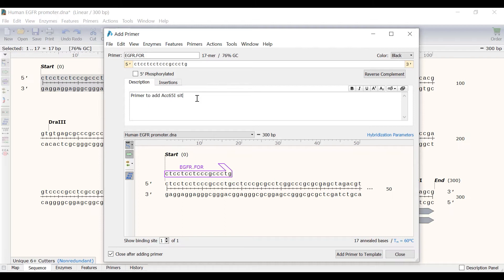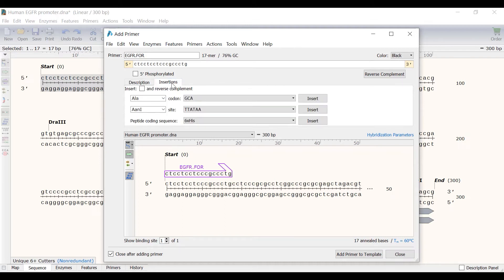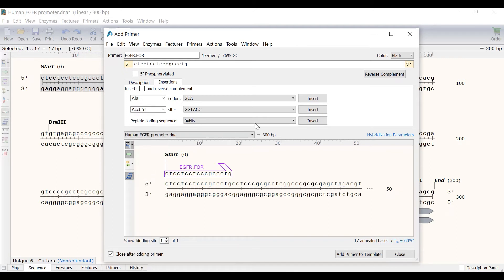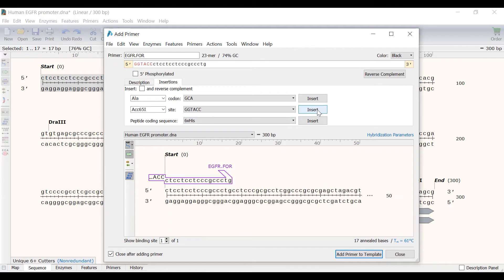Next I will switch to the Insertions tab. Here you can add codons, restriction sites, or peptide coding sequences by selecting an option from the drop down menus. For this example I want to add a restriction site for Acc65I to the start of my primer, so I will click on the beginning of the primer sequence and then select Acc65I from the drop down menu and click Insert. Notice that the restriction site sequence has been added and can be identified by the red font.